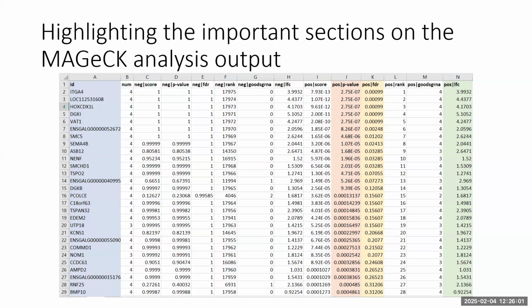You can actually go back, because the MAGeCK analysis, what we found is not perfect. Sometimes it can score genes quite highly. You'll go back and manually look at the guide counts, and when you look at them yourself, you're sort of less impressed with that. What you can actually do is graph each of the guides, the count numbers. You can look at them by eyeball and say, does that actually look like all 4 of them are giving the same kind of clear pattern?